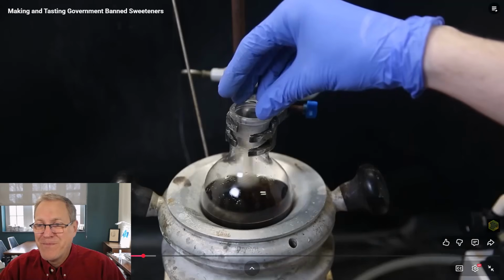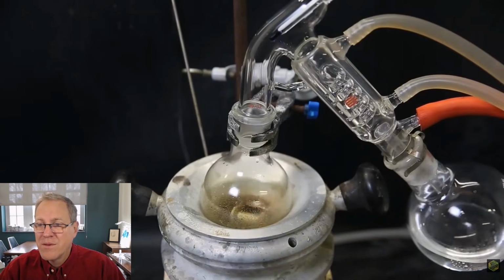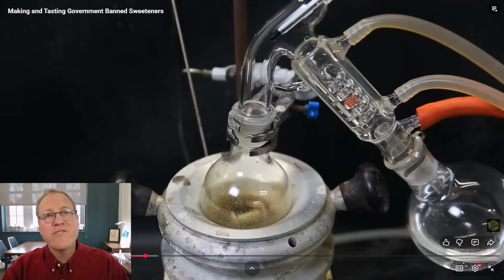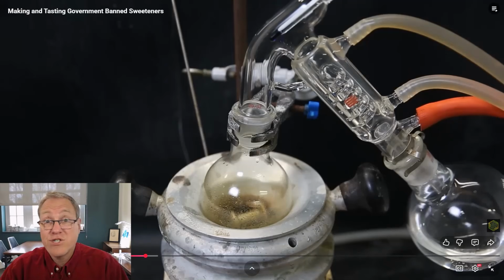I now start distilling off all of the ethanol to isolate the product. When pretty much all of the ethanol is gone, a dark liquid is left behind. So he has evaporated off the solvent to get a residue. Sometimes people say evaporate to dryness, which doesn't mean there's water in there, but all the solvent's gone. So basically all the solvent's gone, and now it should just be his product.